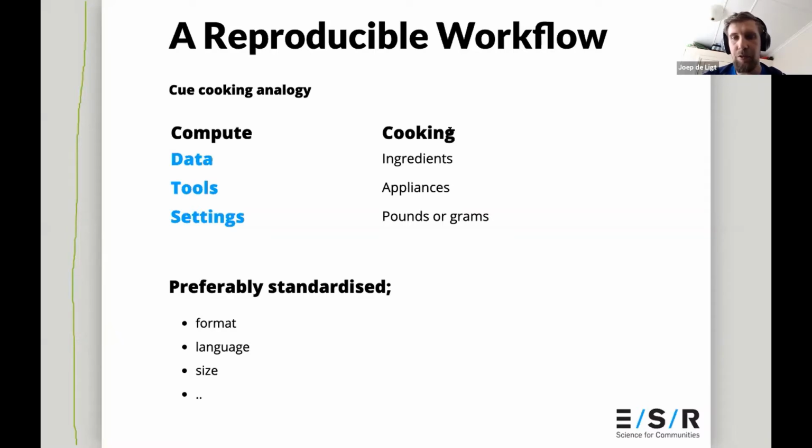Data, that's about formats. One of the things that you do in a workflow language is that you specify the format that the data has to come in. So an alignment will always ingest either a FASTA or a FASTQ file. Of course, people with nanopore data can go, yeah, but I want to align my FAST5 data. Well, that's fine, but then we need to define a new workflow or a new tool that can actually ingest that data and do the alignment in squiggle space. That's fine, and that could still result in a BAM file in the end, but it might have a different input. So it's really important in a workflow that you define those inputs and outputs, and that you are very specific about what you expect to be coming in.